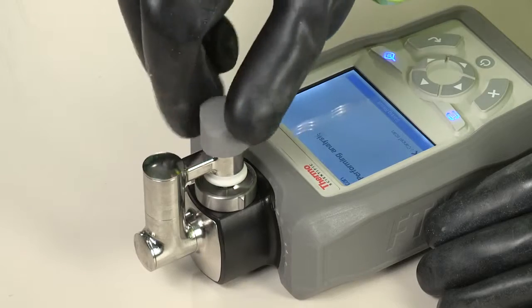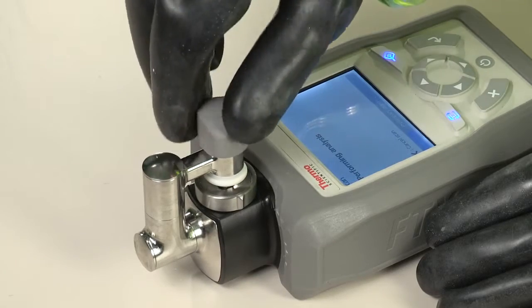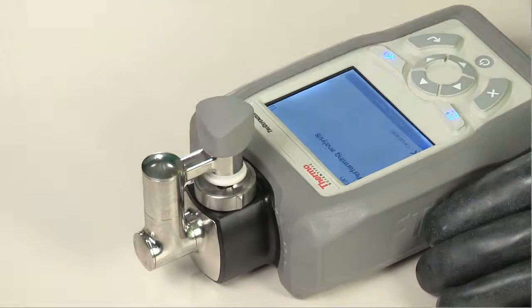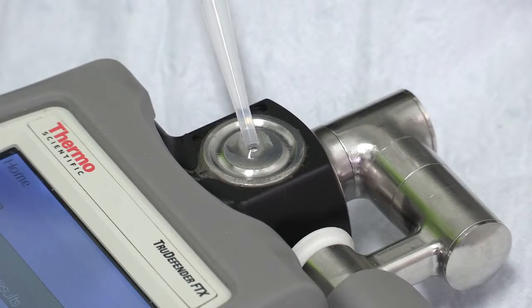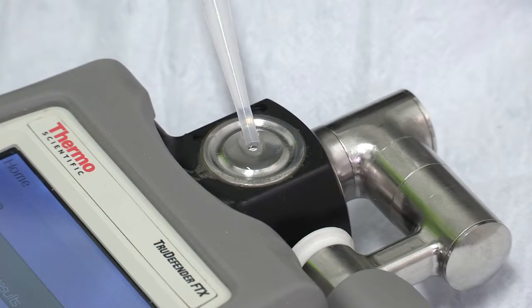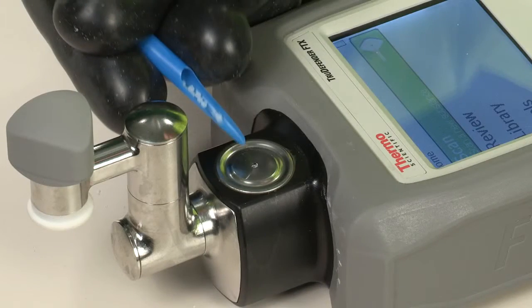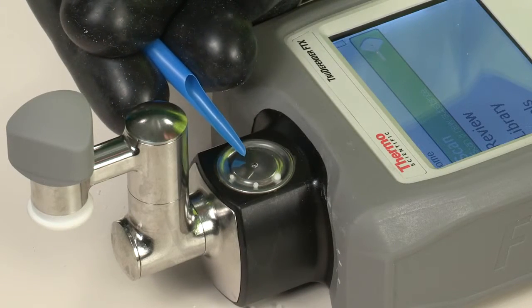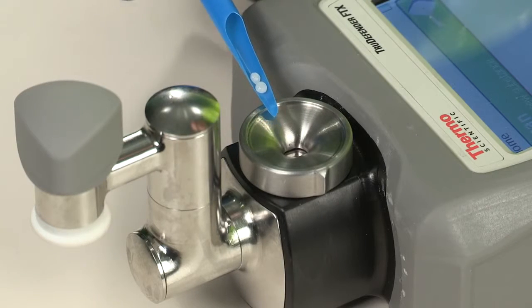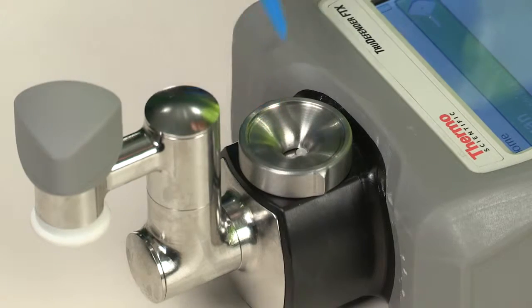Volatile liquids are contained within the sampling surface and can be further protected from the elements. Prills, notoriously difficult samples, are easily managed using the reversible sampling accessory. Technicians have clear visibility of the sample surface and can operate the instrument when faced with limited dexterity and visibility.